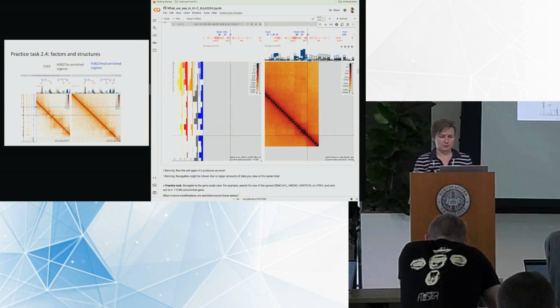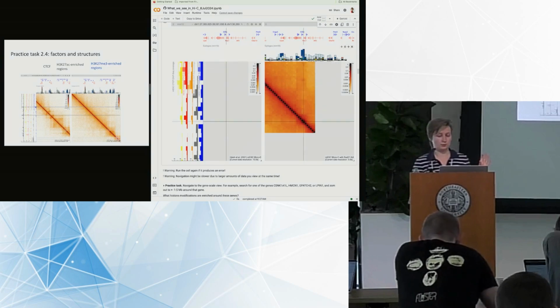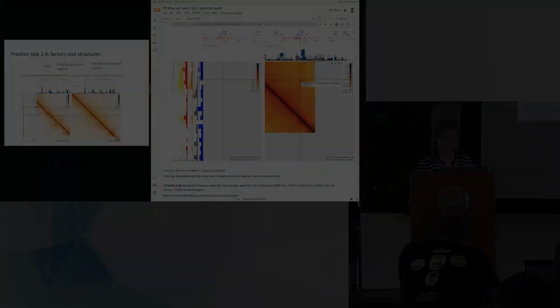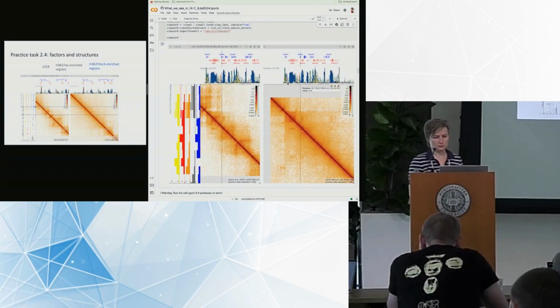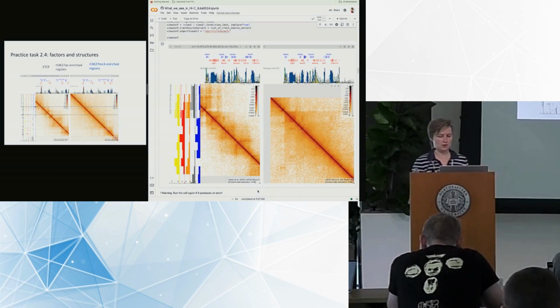And this is a nice example where there is an active chromatin here, and on the right it will correspond to the compartment. It's not super visible now because the view is not updated properly, but you already can see that this big blue chunk here corresponds to the compartment formation on the Hi-C map. Yeah, it's very slowly updating, and I hope you can appreciate the power of this view and how easy it is to see what the structures in Hi-C are associated with.